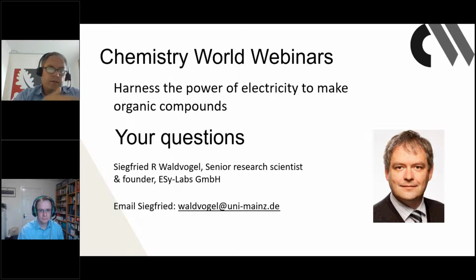And if you have the calculated charge, usually you lose a little bit, but it usually gives you a good conversion. Just keep in mind the last 5% are not so easily converted, because then you have, among all the other molecules in there, only some substrate molecules, and they do not come in time to the electrode. But usually, as a synthetic organic chemist, with 95% you're quite happy.